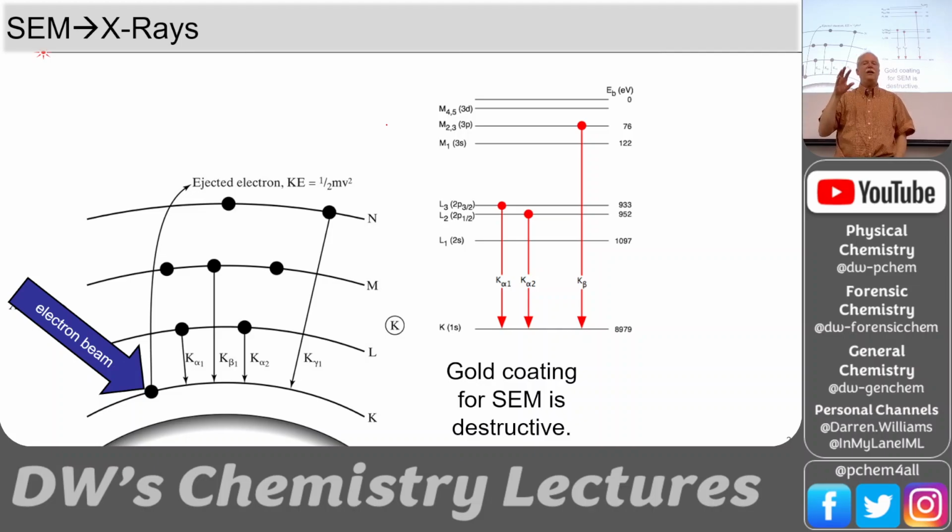So imaging, we want to keep the electron beam as low as possible so we get a good clean image and we don't charge the surface. But when we want to get X-rays out of the surface, we find a particular spot and then pressure wash, and we get X-rays out. So with EDS or WDS, the spectroscopy part, we can get the elemental composition of the substance for row 3 and greater on the periodic table from the X-rays that come out.